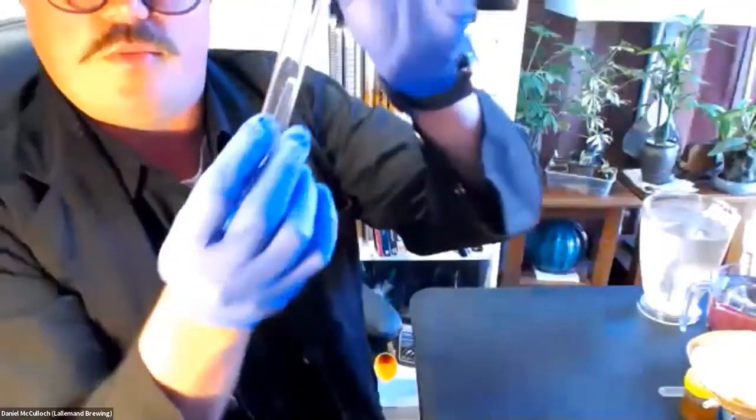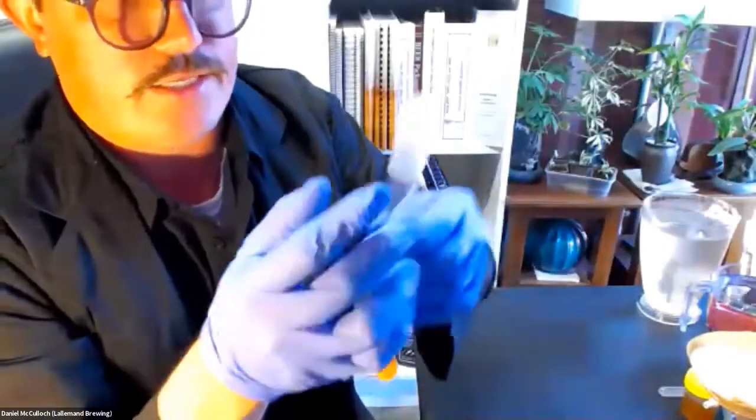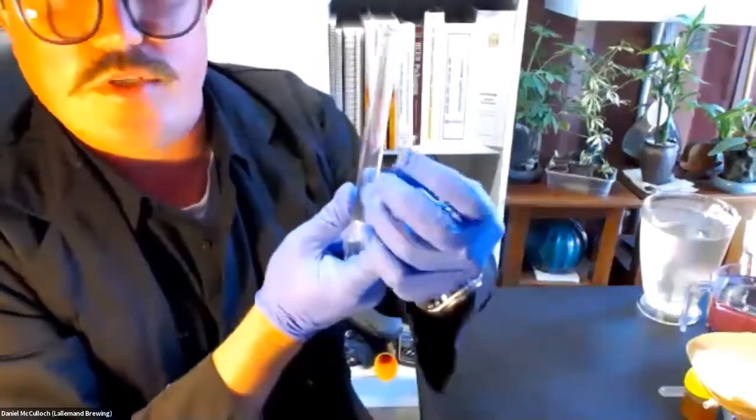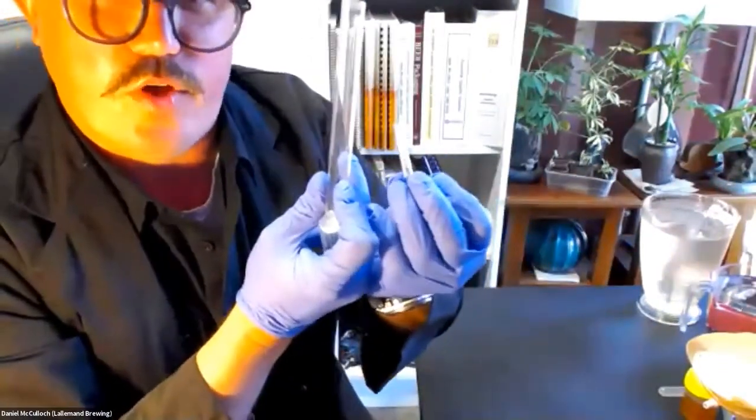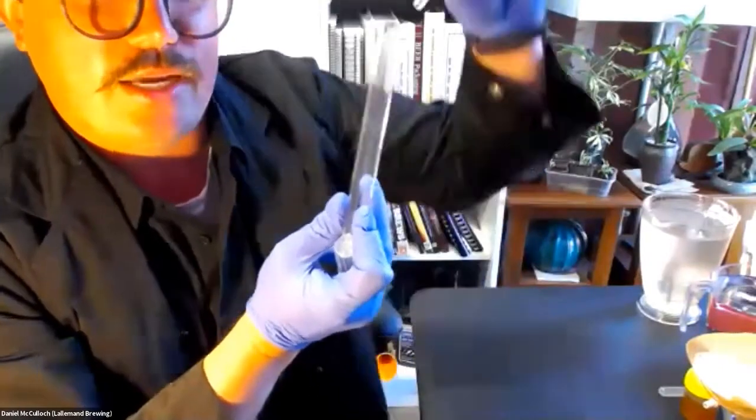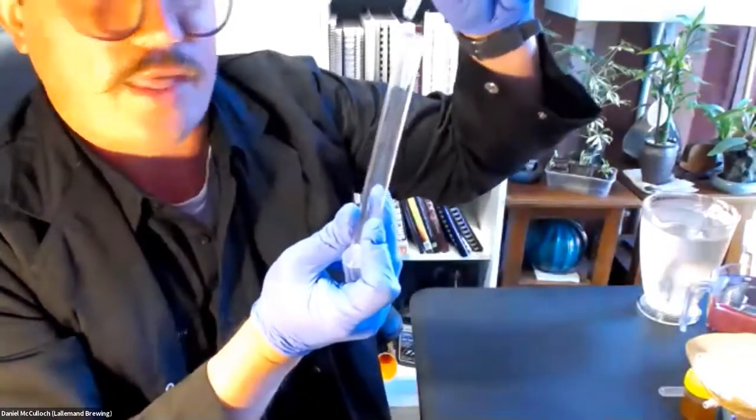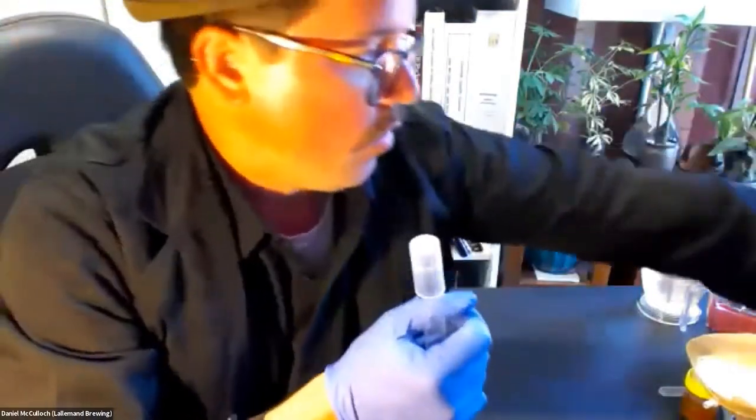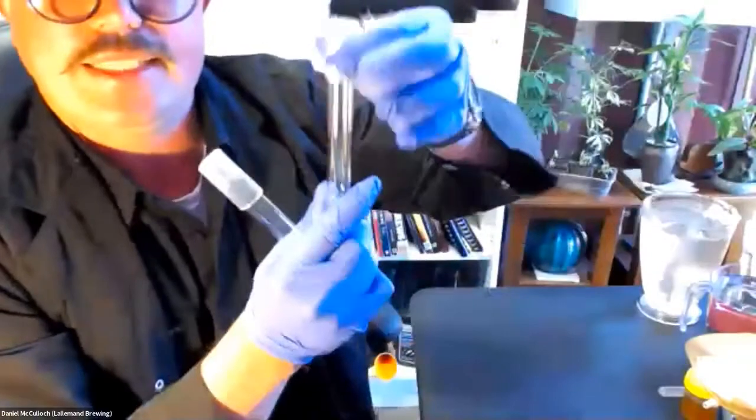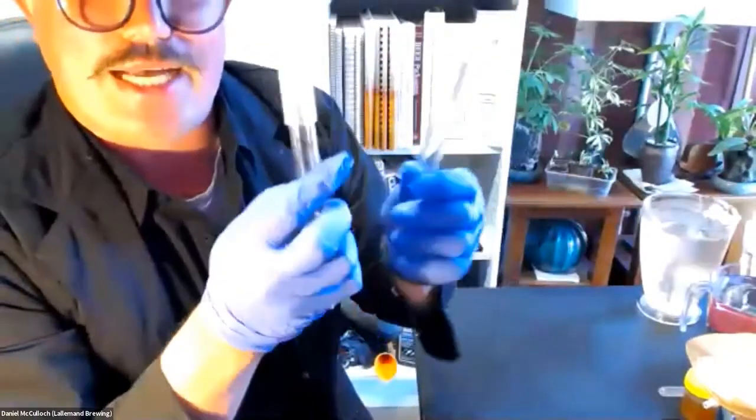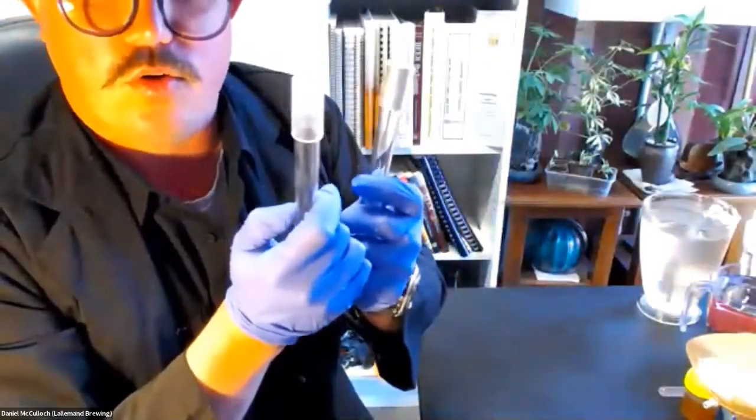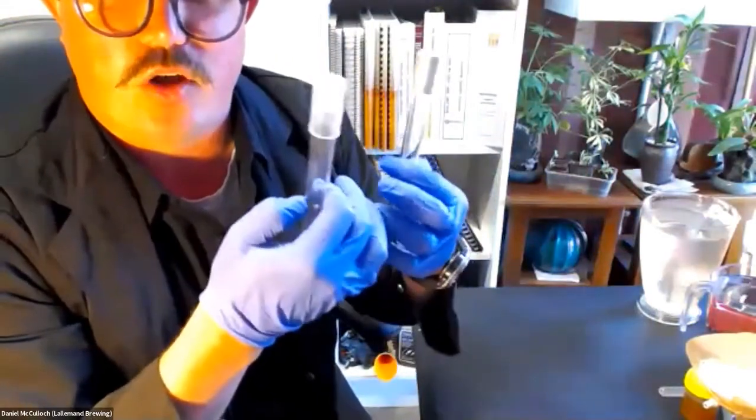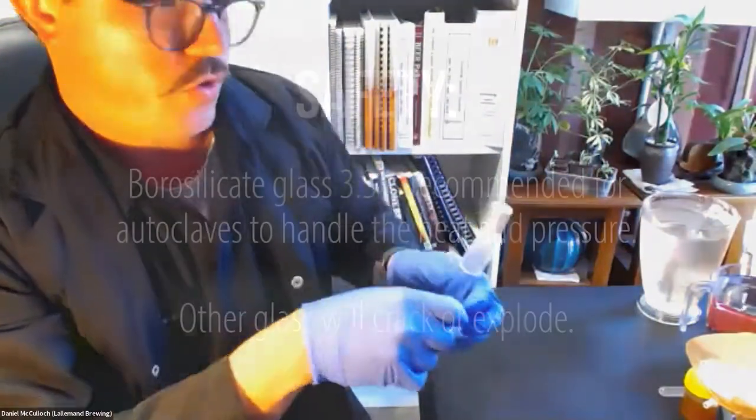The next step for the Durham test is to have a test tube and a Durham tube. So you have a test tube, the Durham tube is just like a smaller version of a test tube. And that goes in the opposite way, because you want the gas to be captured in that. And then you'll have a cap, whether it's plastic or something like a metal cap. And because we're going to put this glass into a pressure cooker or autoclave, you want to ensure that it's borosilicate glass, so it's not going to explode in the pressure cooker.